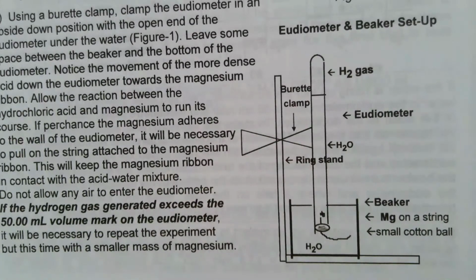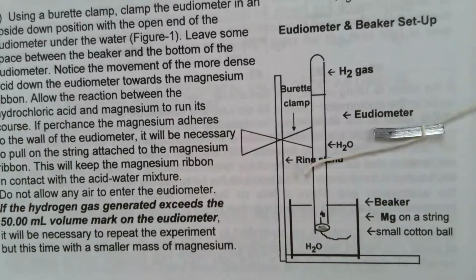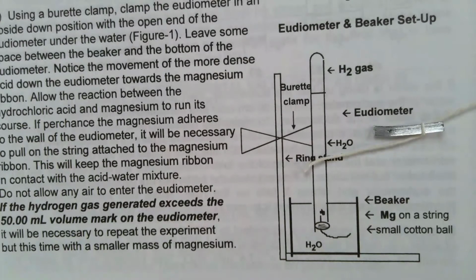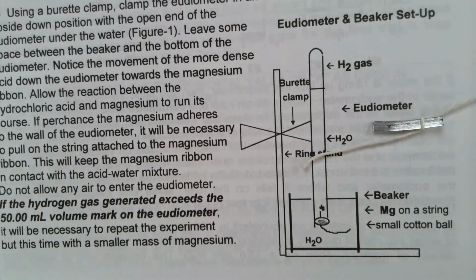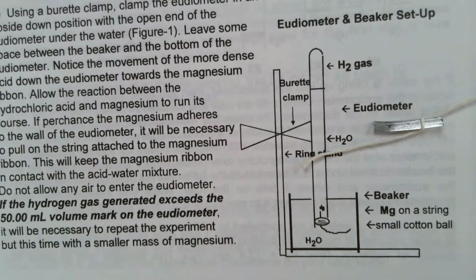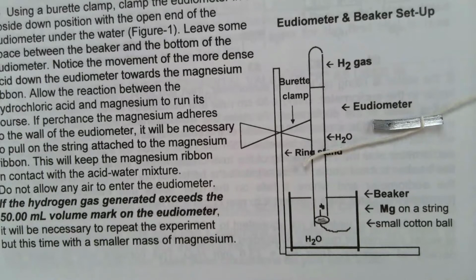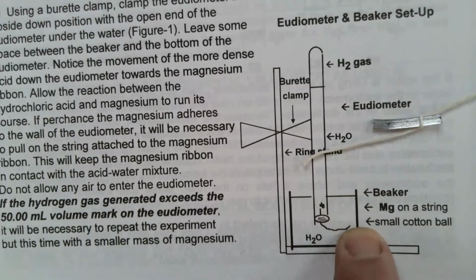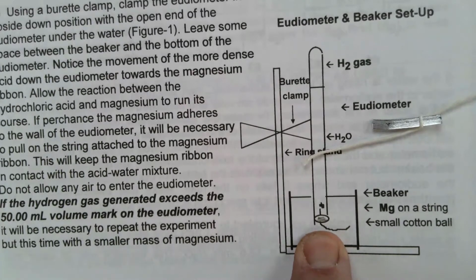What we're going to do is weigh out some cleaned magnesium ribbon. I've cleaned it already, weighed it out, and tied it to the string. The reason we clean it is because on the surface there's magnesium oxide and magnesium nitride, and those add weight to the magnesium. So I took a piece of steel wool and cleaned it, then I weighed it, and I'll put that data in the data table. I tied a string to it, and in the bottom of the picture, your magnesium is on the string, and then there's a little cotton ball.